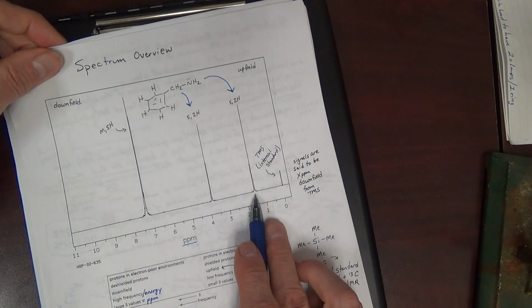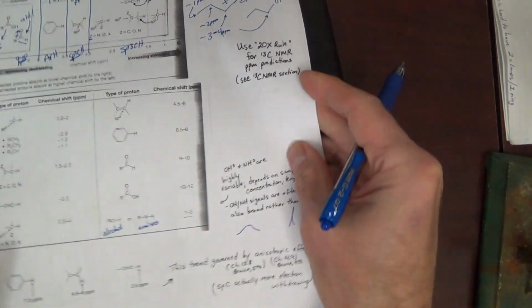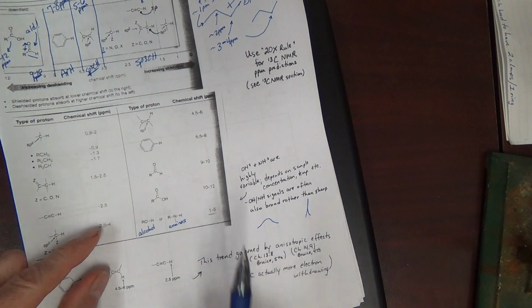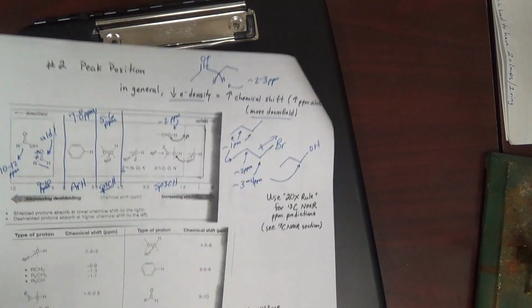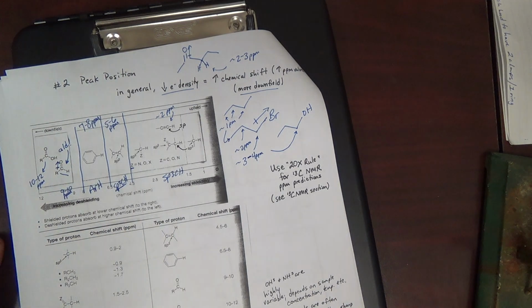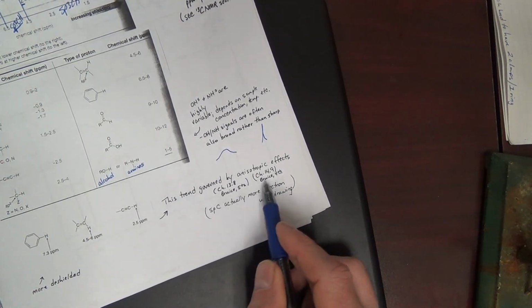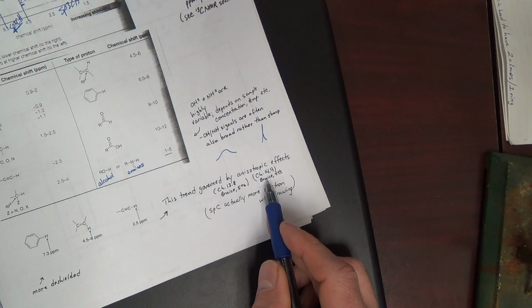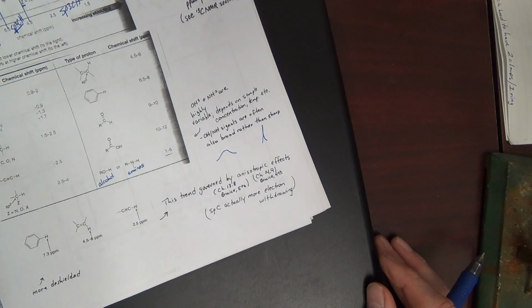And then the last signal we can assign to the NH2, about 1 to 2 ppm, and that does fall in the range as indicated here. By the way, Bruice was a book that we used a while back. I'm sure that the Klein textbook will also discuss anisotropic effects.